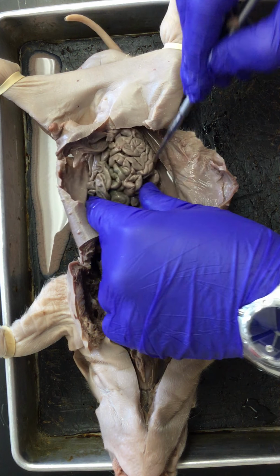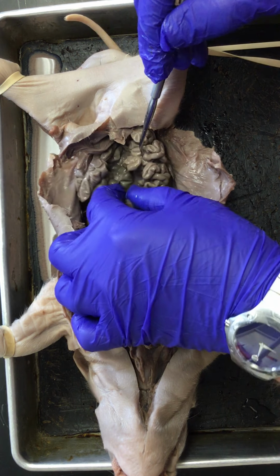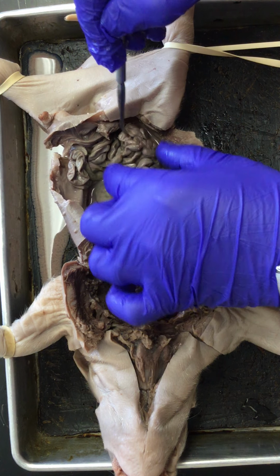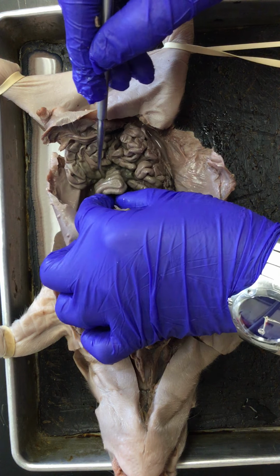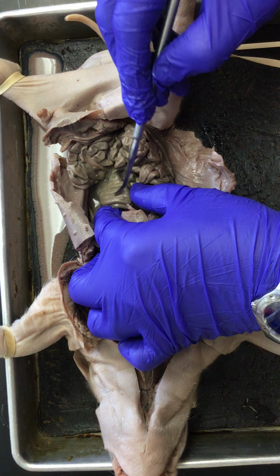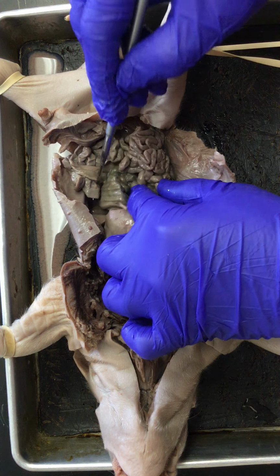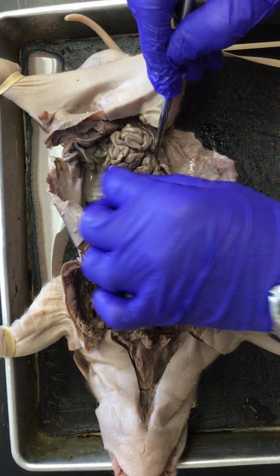The small intestine is all of this mesh over here on this side. Let's see if I can separate it from the large intestine. Large intestine is just right here, sort of curves back and around, much smaller than the small intestine. The small intestine takes up all this space. The small intestine is decidedly softer and more malleable than this large intestine. This large intestine is embedded in a lot of mesentery, so a lot of connective tissue holding it together really tightly. And so it's very firm and not particularly yielding when I push on it with the probe. But the small intestine is incredibly yielding and feels like I could easily manipulate it, squeeze it, anything I want with that. So very free-flowing small intestine, very rigid and fixed large intestine.